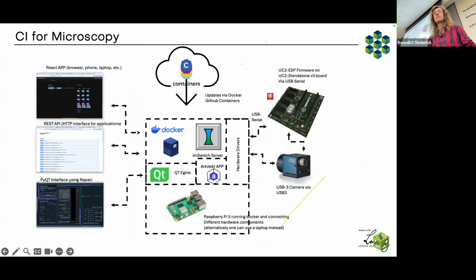Another thing that is becoming a bit involved is that you have a camera, a stage, a laser, maybe some image processing, and all of these different elements have to work in an orchestrated manner. Move the sample, take an image, move the sample, take an image, capture all these things in storage, and then eventually display that in 3D.